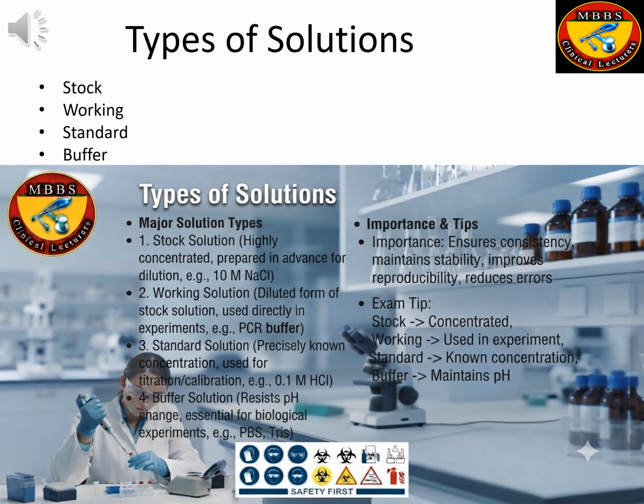3. Standard solution. A standard solution has a precisely known concentration. It is mainly used for titration, calibration of laboratory instruments, and analytical chemistry. Standard solutions are prepared using analytical-grade chemicals and accurate volumetric glassware. Example: 0.1 M hydrochloric acid, HCl.